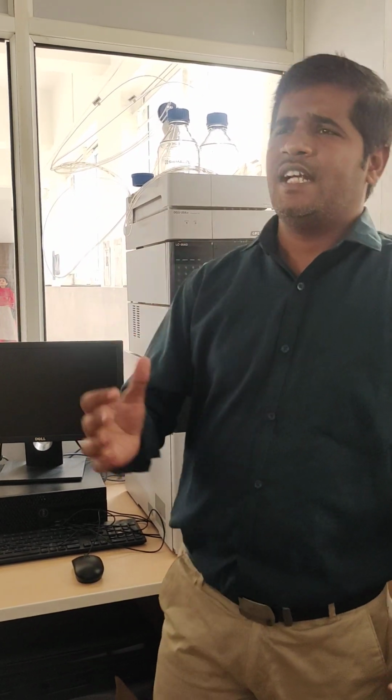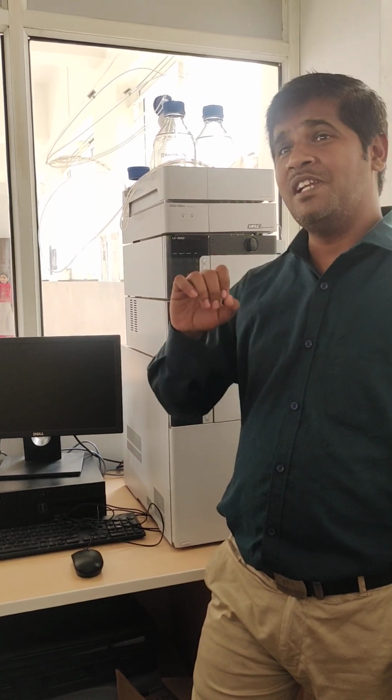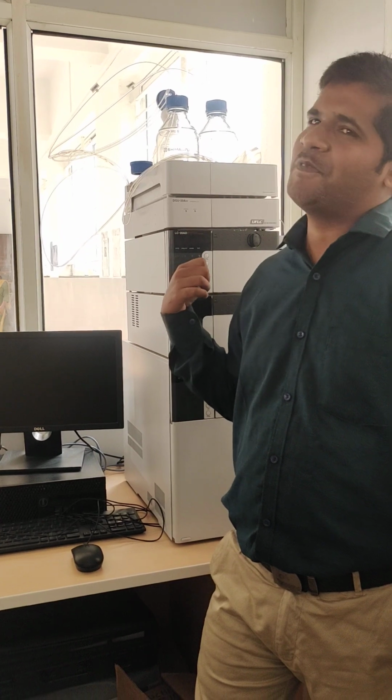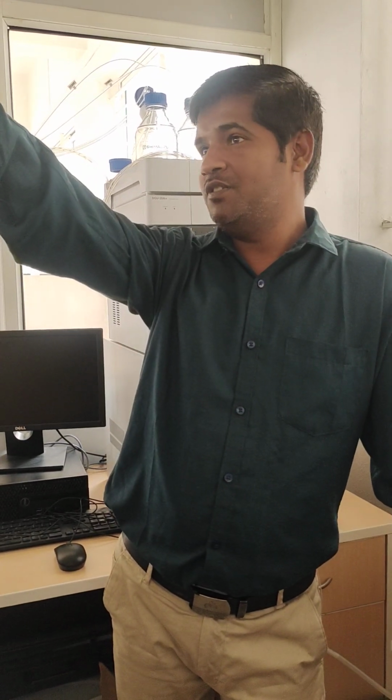It means in every analytical section we can use this HPLC. So many uses are there; we can tell limitless uses of HPLC. Anywhere you go, HPLC will be available. Even when we are testing milk, there also we are using HPLC. We are measuring the presence of fat in the milk, the concentration of fat, the presence of volatile content in the milk, and the presence of oil content in the milk, with the help of HPLC. So you just find any milk-containing industry. Here Gokul Dudhsagar is available, na?